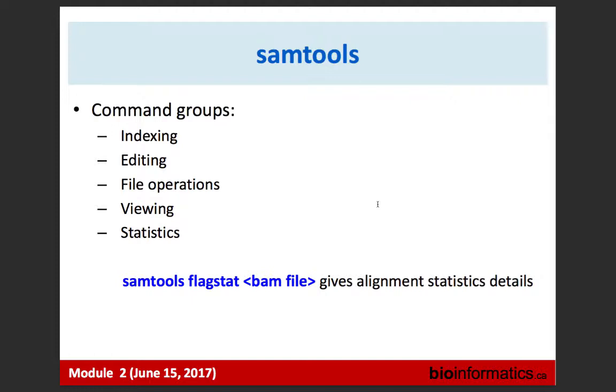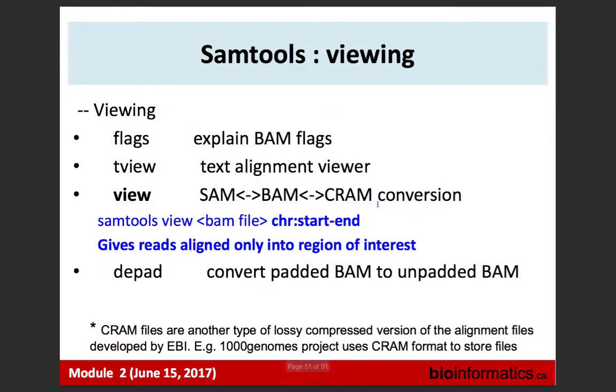Please raise your hand if you have heard about SAMtools. Quite a few, so that's great. SAMtools is very useful. They're well tested, and the entire community is using them. We can really do a lot with our alignment file and SAMtools. We can use it for indexing, we can view it, and we can also grab statistics and do quite a few things.